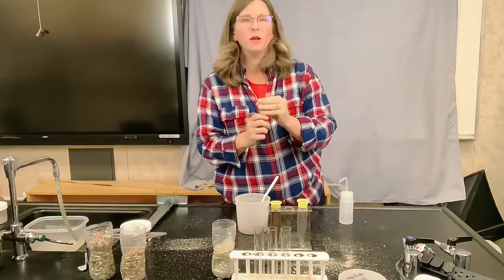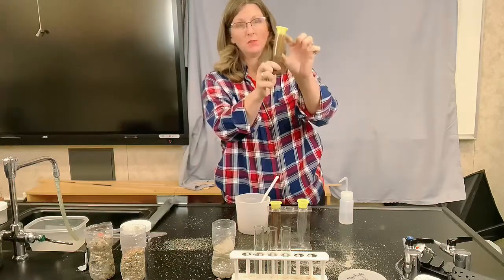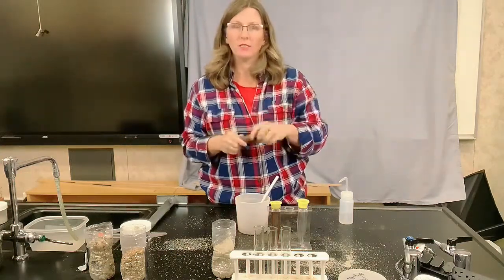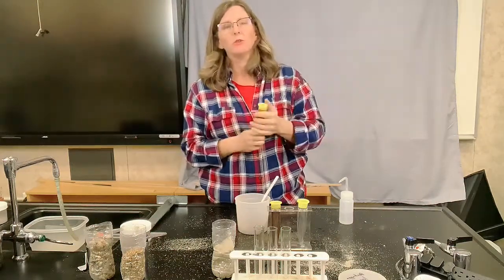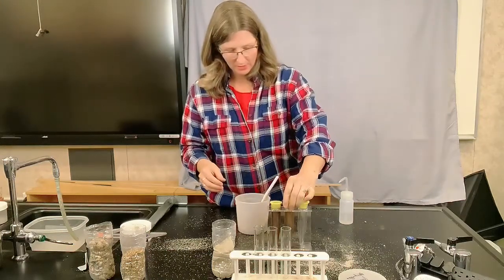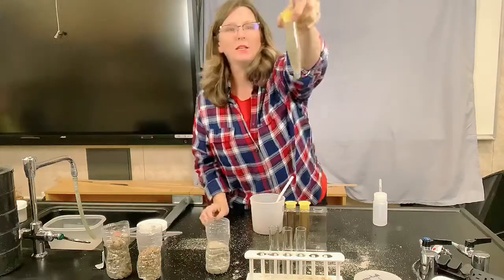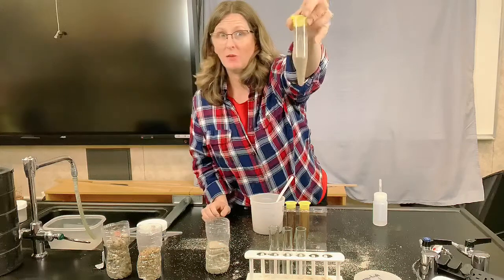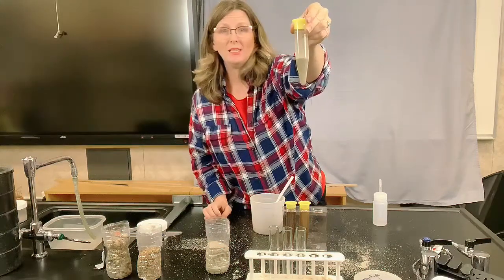It'll also help us to do a chemical testing later, because into this water it's going to dissolve the nitrogen, the phosphorus, and the potassium. Any mineral that you want to test, those are the big three we'll be testing for. I'm going to do one more for you, and that'll be our volleyball sand. You can see this one much more rapidly. See how quickly the sand settles, and see how that water's almost clear. There's virtually no silt and clay in this.